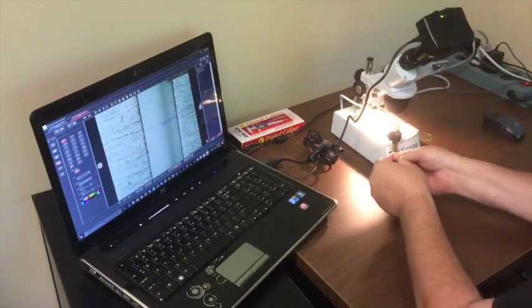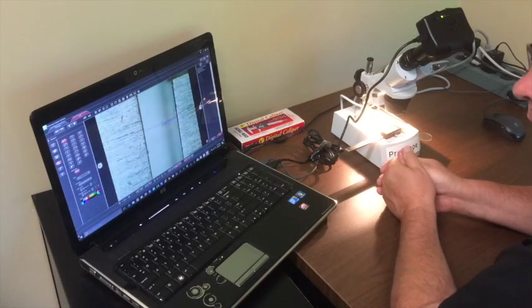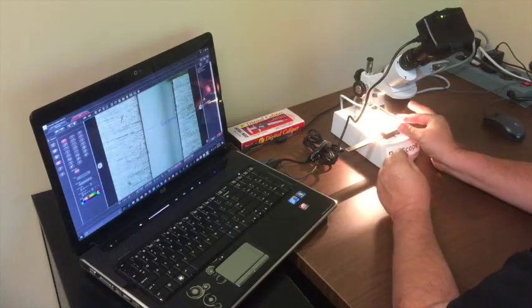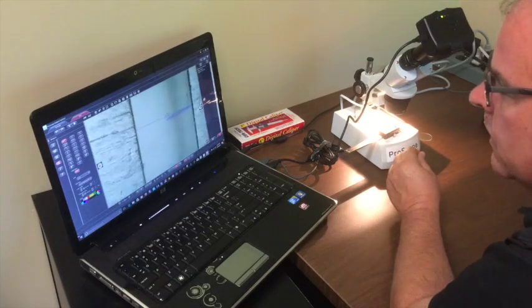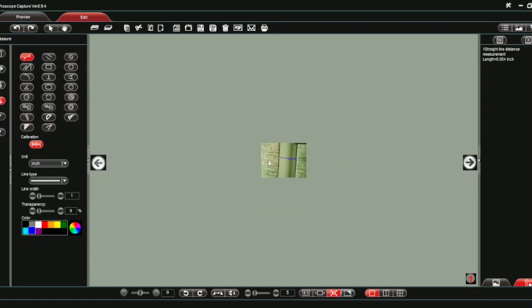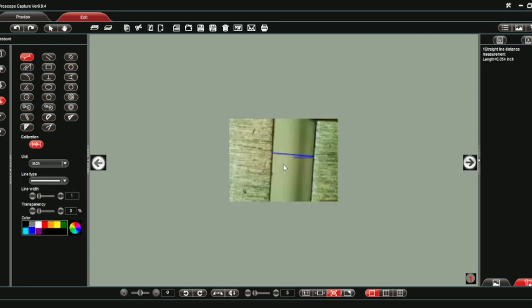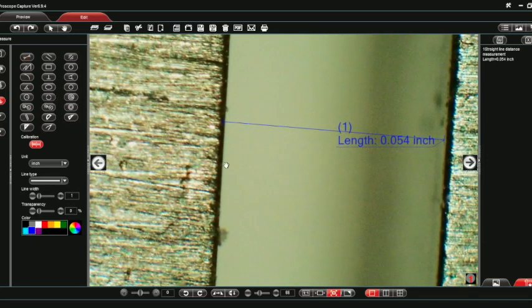That's how this inspection tool works. You could take anything else — for example, your roofing material, cut a slice, and find some way to hold it underneath. Once it's in focus, you can zoom in on the material for a closer look or zoom out. Even when zoomed in, you can still measure and it doesn't change the calibration. Taking the measurement tool and clicking this edge and this edge still shows fifty-four thousandths of an inch. Hopefully this helps and works well for your processes. Thank you.